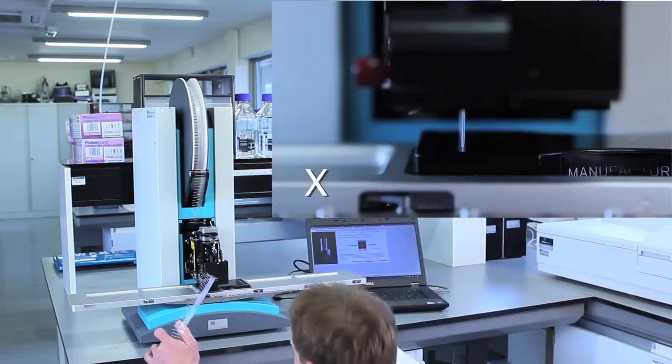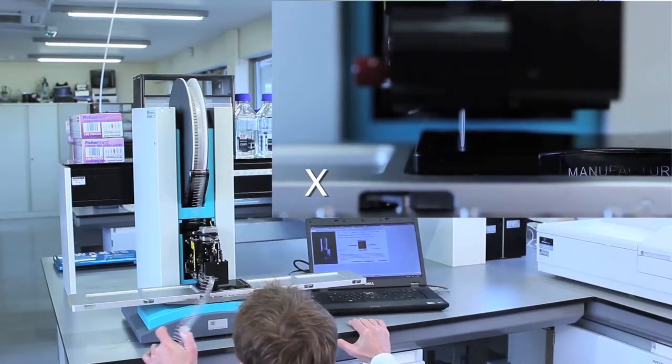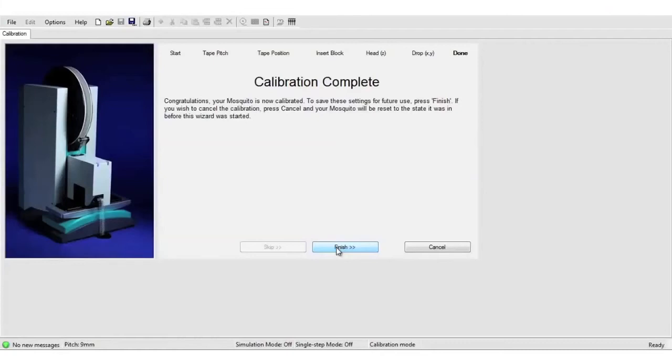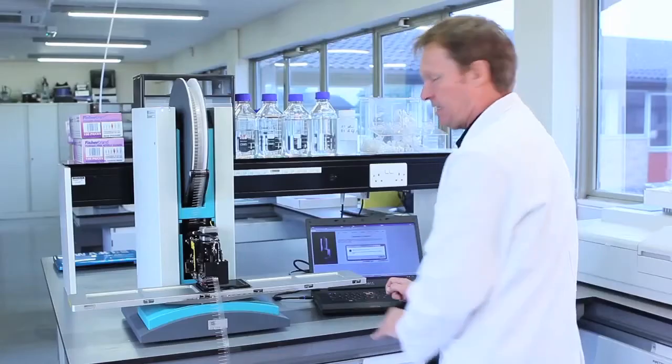And we also look directly down. And same again. And that is how quickly and easy it is to calibrate the mosquito.